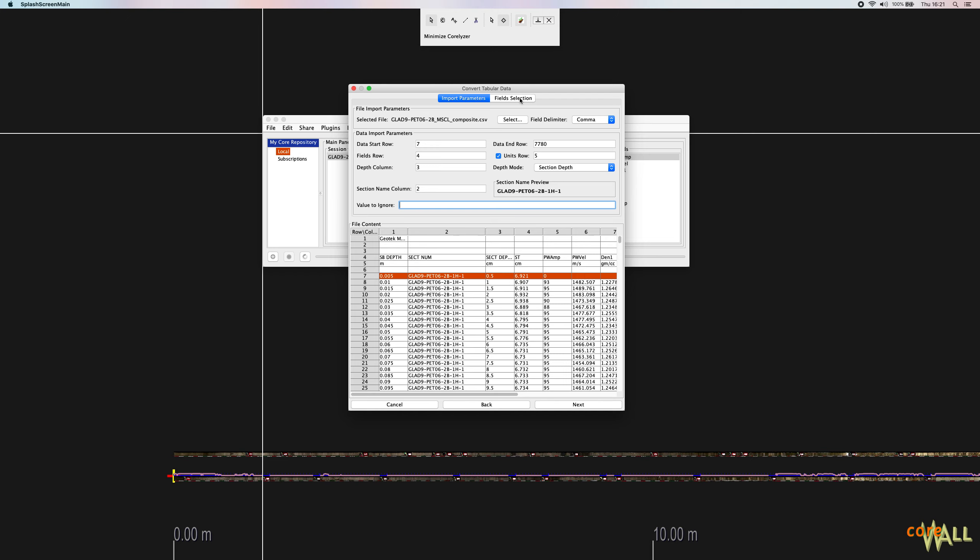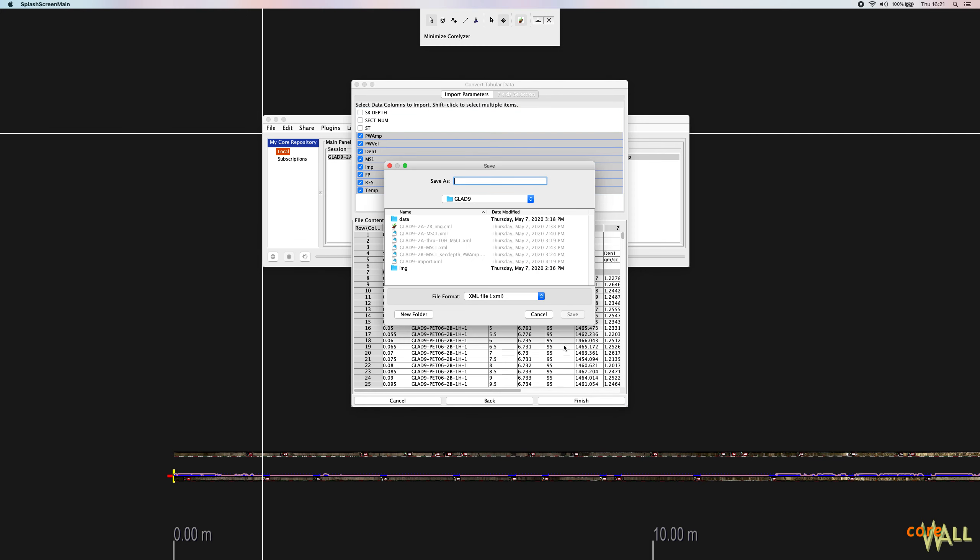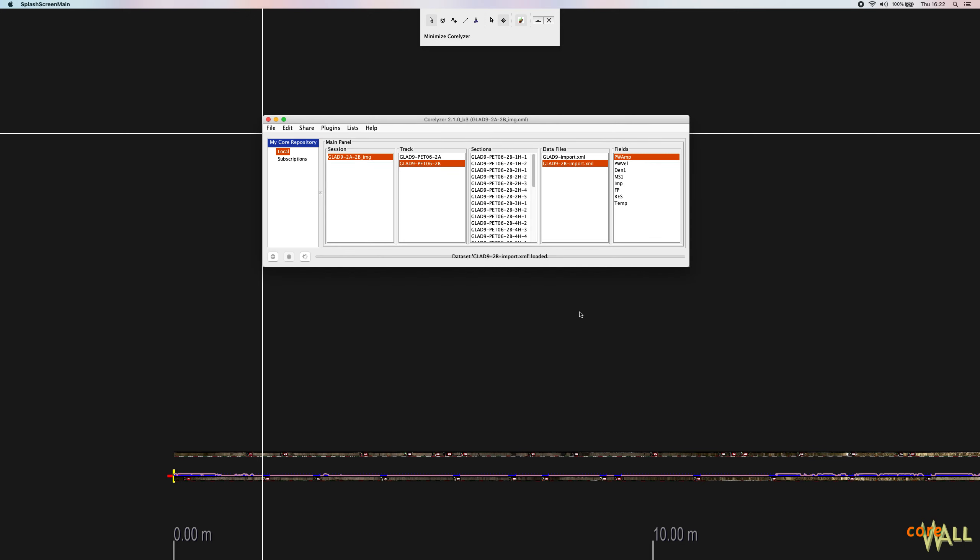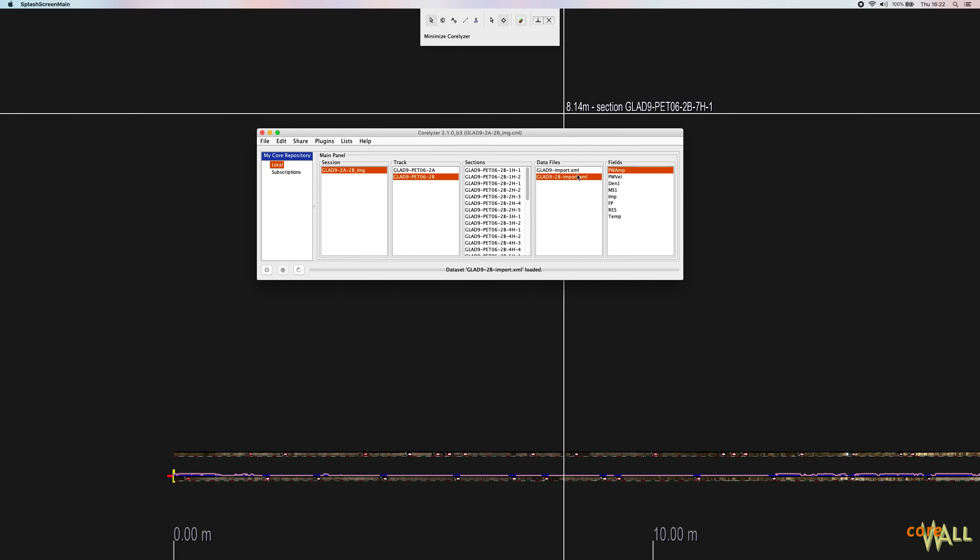So I now move ahead to the field selection dialog. Choose my columns. I'm going to choose them all in one fell swoop by shift clicking. Go to finish. Glade 9, 2B, import. When I click save, this will automatically be imported into my session.